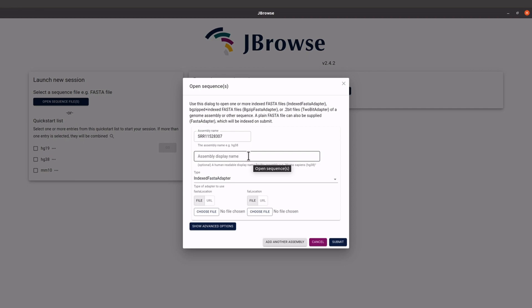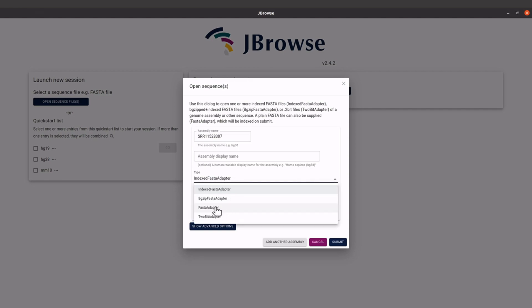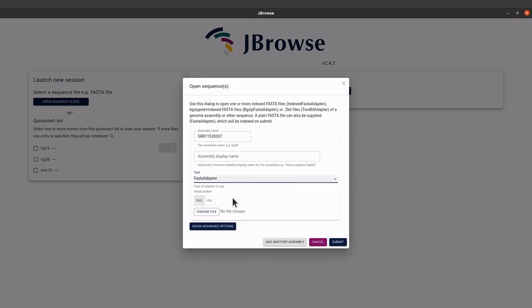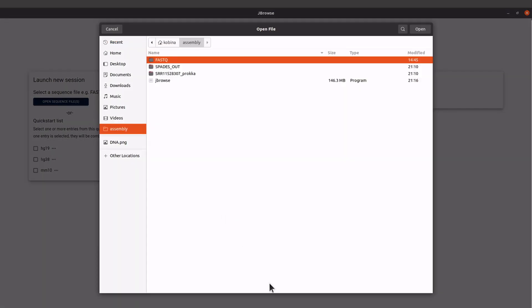We also have 'Assembly Display Name' — this is optional so I will leave it. When we come here we are going to load the FNA file first. Ours is not indexed so we will click this and then select 'FASTA Adapter'. When we come here, make sure we click on 'File' and then click on the 'Choose File' button.